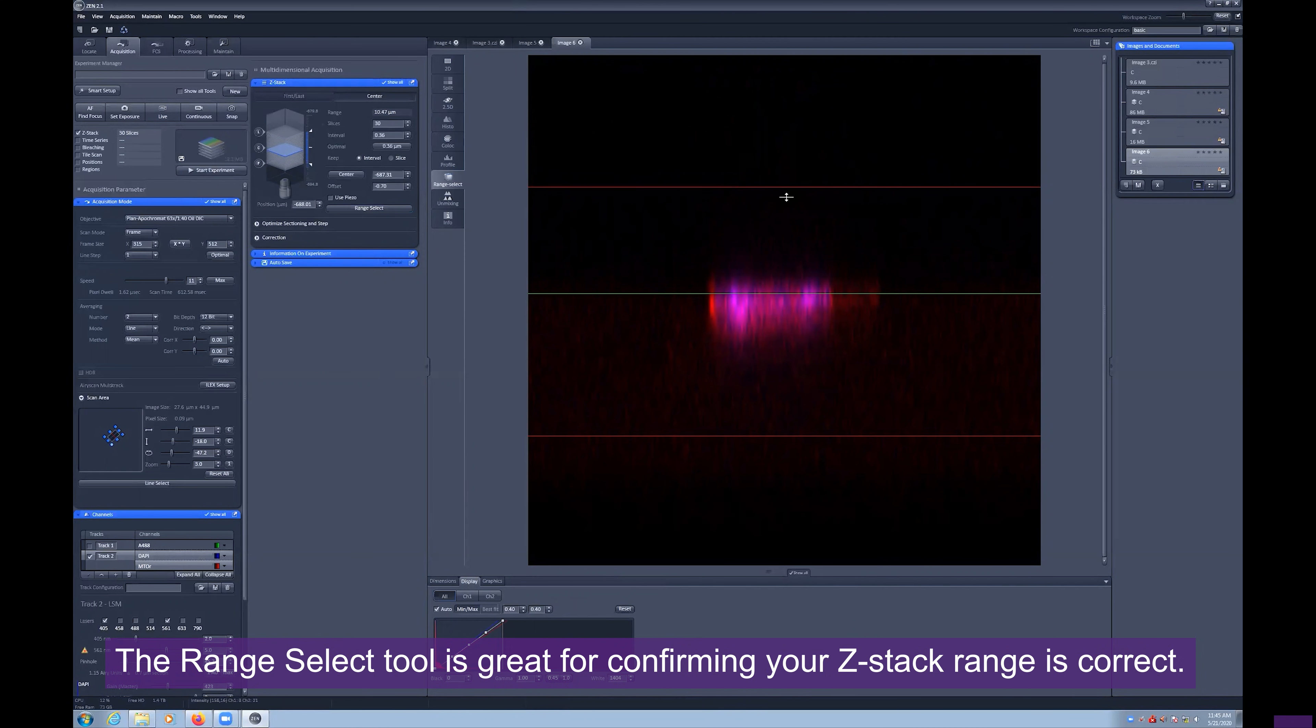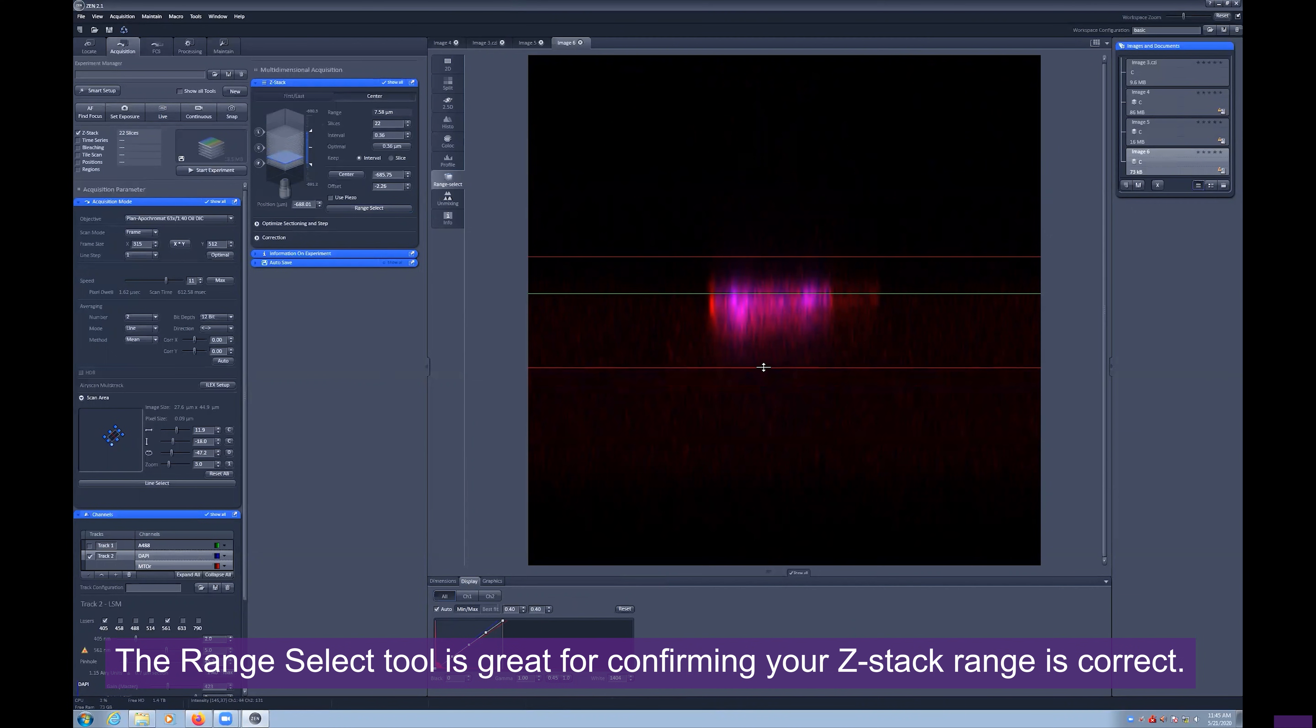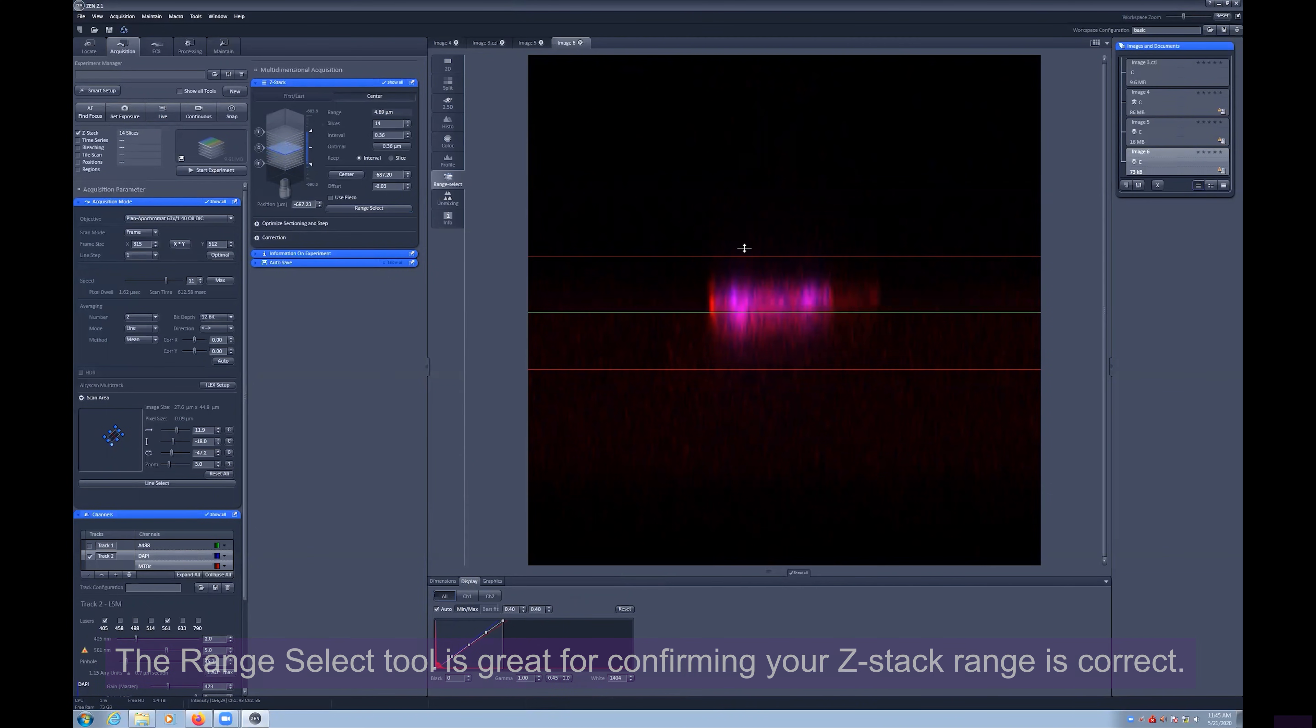These can then be adjusted as required, and if you have trouble selecting the true center due to the line moving, you can lower your slice interval to a smaller number.